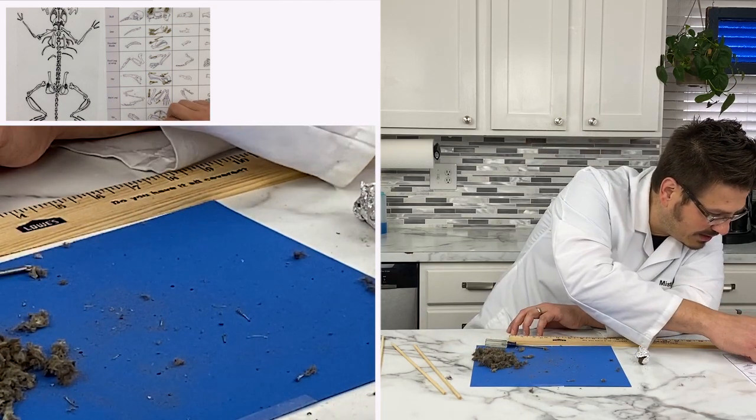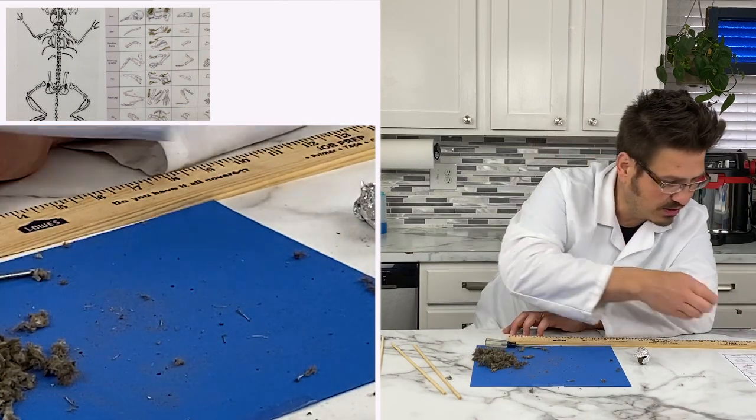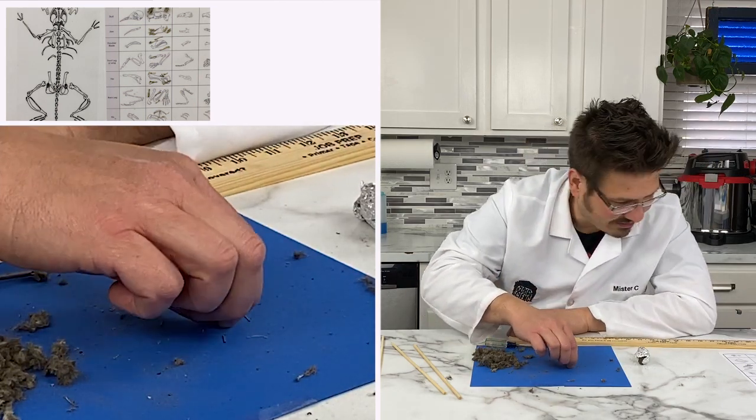And I think these might be little teeny tiny vertebrae, because that one little skeleton was so small. I think I found a couple of vertebrae. Yeah, these have to be vertebrae.